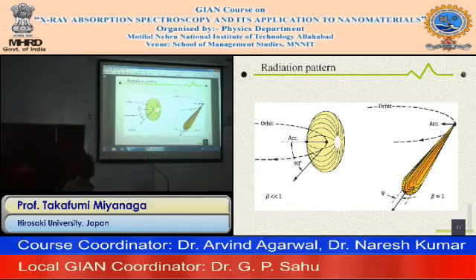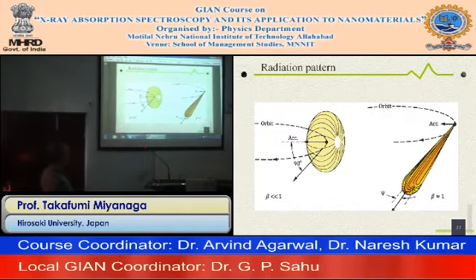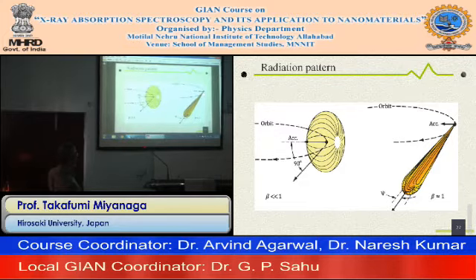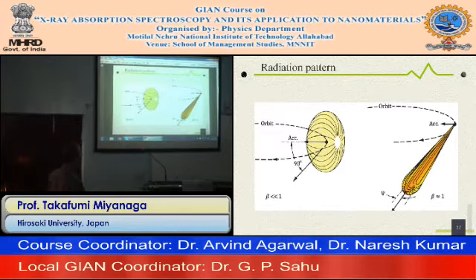The force applied to the electrons is small, so the radiation is weak here. On the other hand, the electron speed is very close to the speed of light. The sharp and coherent X-rays are produced in these directions.